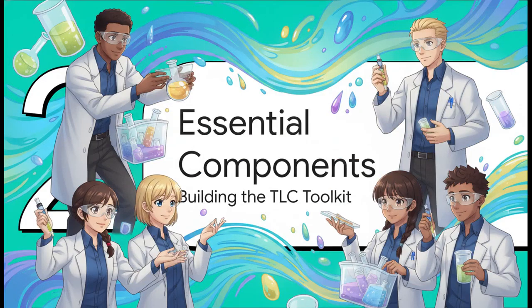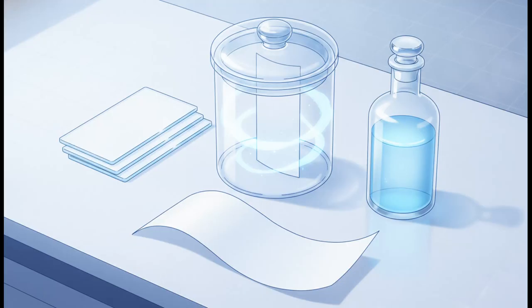Moving right along to Section 2, essential chromatography components. Before we run our race, we need our physical toolkit. Based on Dr. Chem's protocol, you really must have these 4 core elements for a successful TLC run. First, your inert plates, usually glass or aluminum coated with silica. Second, your TLC chamber, which is really just a sealed glass container. Third, your high-purity mobile phase solvent. But hey, pay super close attention to this fourth one, the moistened filter paper. A lot of beginners skip this, but honestly, it's a real game changer.